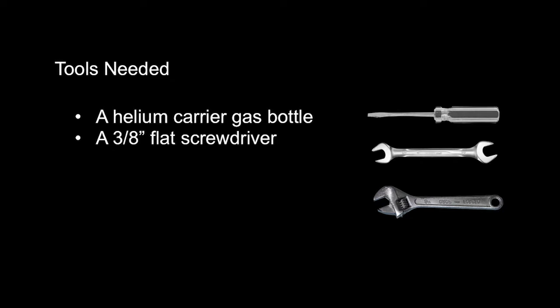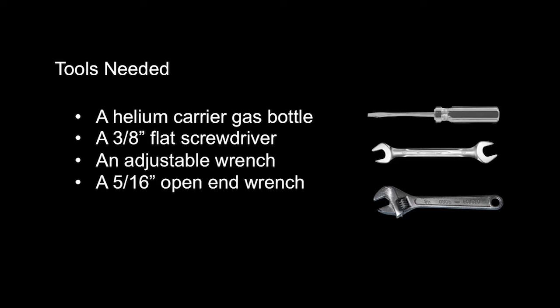Here are the parts needed to replace the Helium Carrier gas cylinder: A Helium Carrier gas bottle, a 3/8th of an inch flat screwdriver, an adjustable wrench, a 5/16th of an inch open-end wrench, liquid leak detector or gas leak detector.